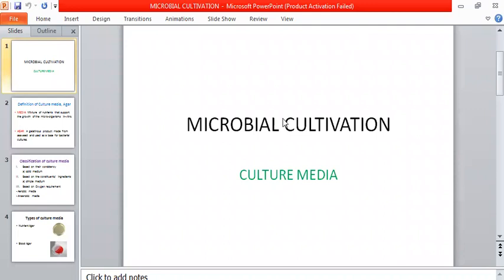Good evening, everyone. Today we are going to talk about the growth of microorganisms. In the previous class, we discussed various types of microorganisms: bacteria, fungi, parasites, and viruses. Today we are going to focus on the bacteria and how we can grow the bacteria in the laboratory.